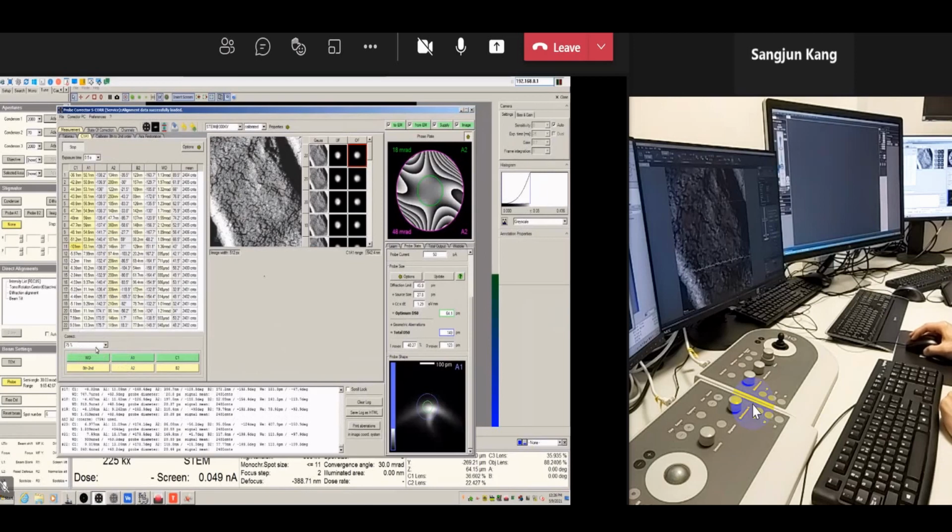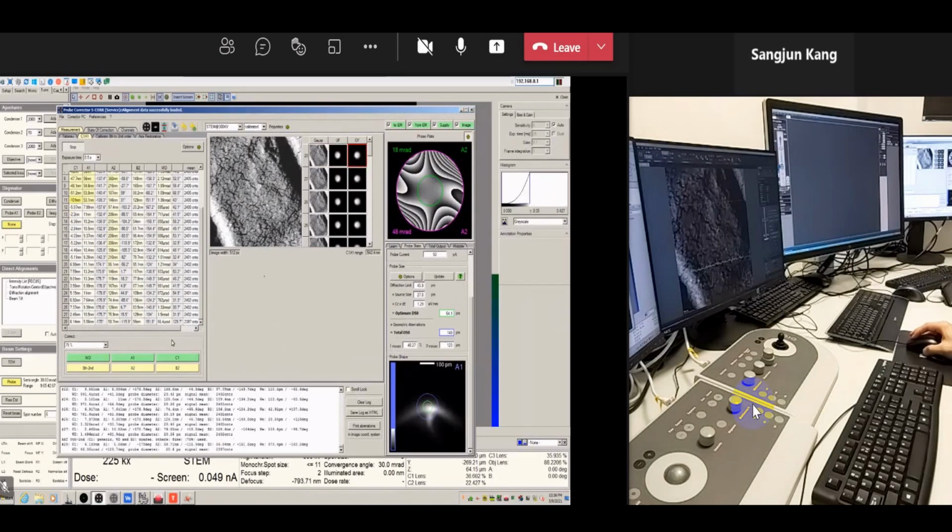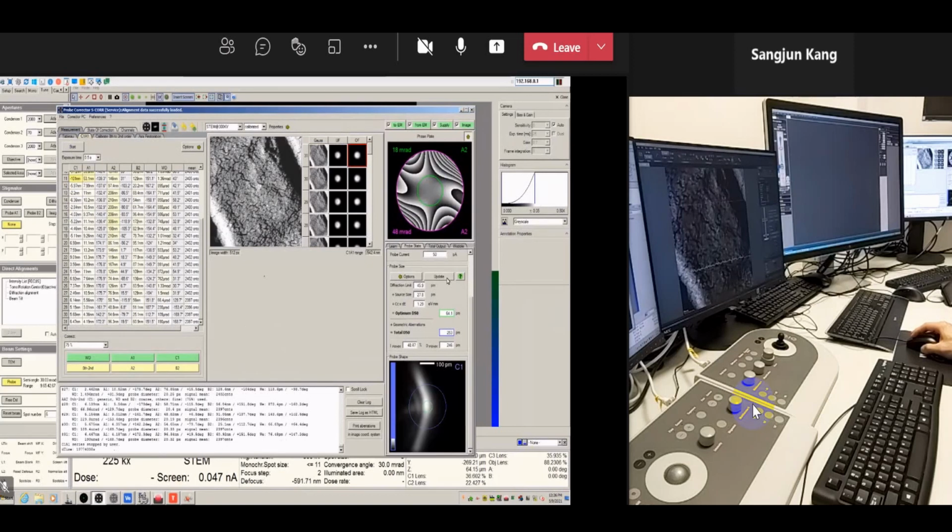So we reduce the correction values a little bit so that we move within a range not as big as the number here. Our probe already looks very good, round and small. So one more 0 second. Actually, we do not need to spend too long here, because once we change the high order aberration in the tabular measurement, the lower order aberration will be changed as well. So that's enough, and I will stop here and we can update the probe.